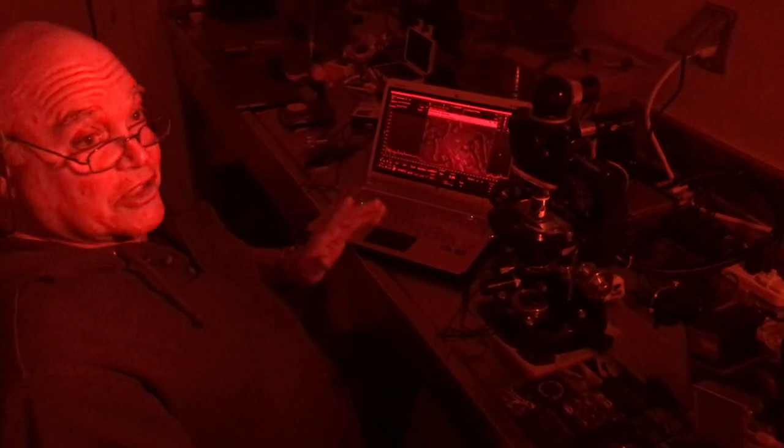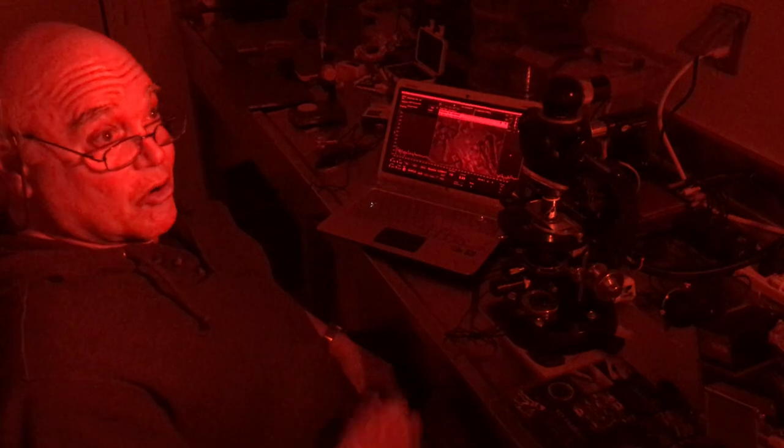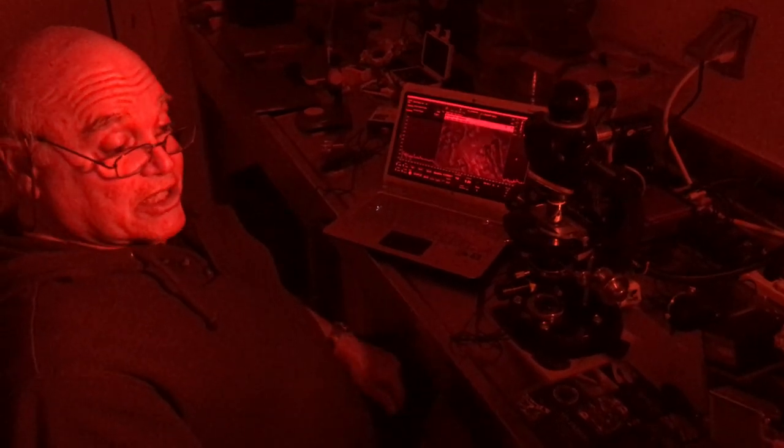You have to do this in infrared light or deep red light because in the active measurement you're destroying the pigment. So you want to do it quickly and use a very small amount of light.